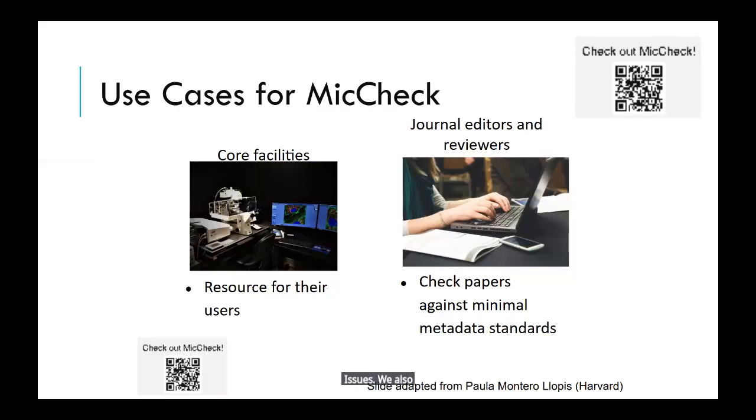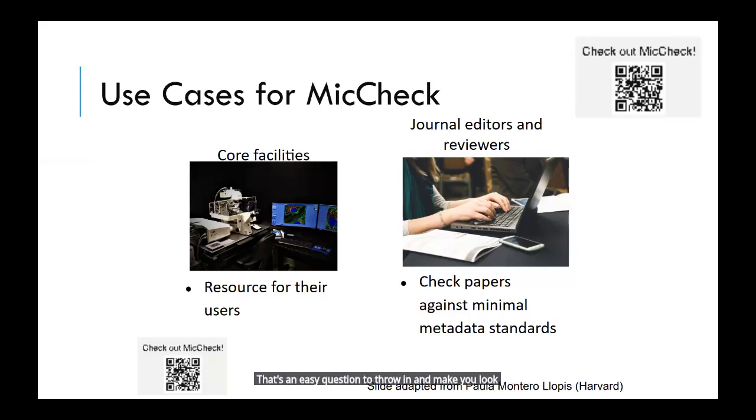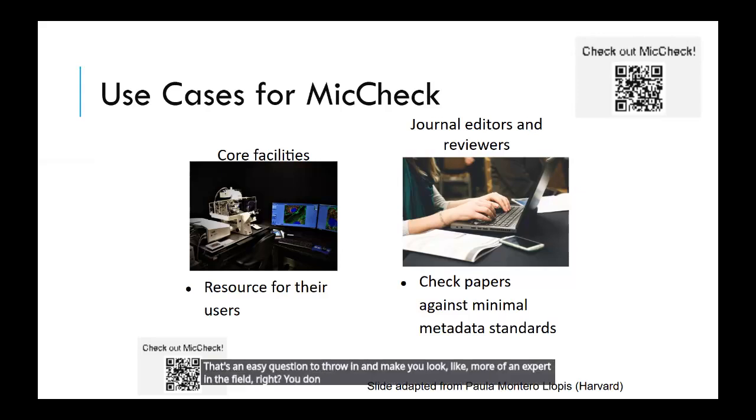We also hope core facilities can use it, because it's hard for me to respond to an email of, can you help me with my methods in a robust, timely way that's accurate and reproducible. And then for editors or reviewers who have never touched a microscope, how would you know what you should be asking, right? And this way you can be like, well, they did multiple colors and they didn't report on what filters they used. That's an easy question to throw in and make you look like more of an expert in the field, right? You don't need to say that it was wrong, but just ask that they report it.